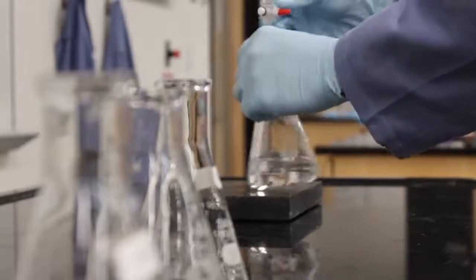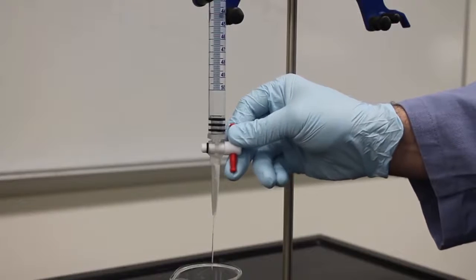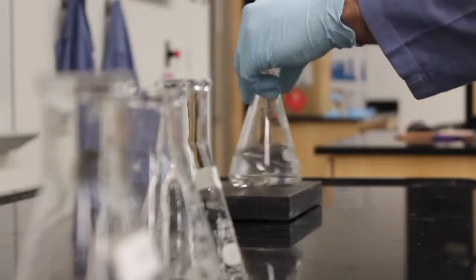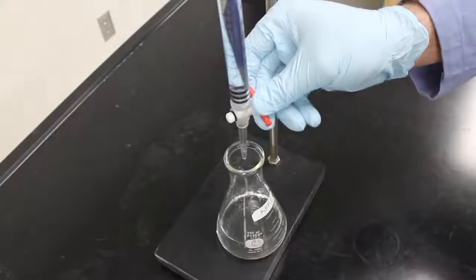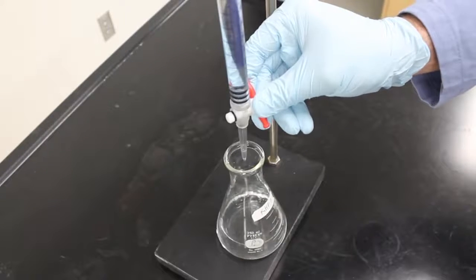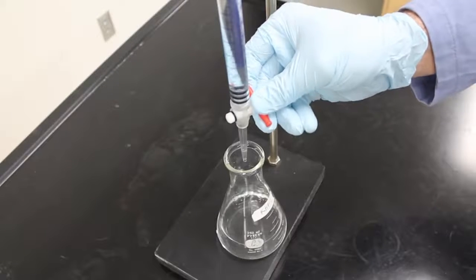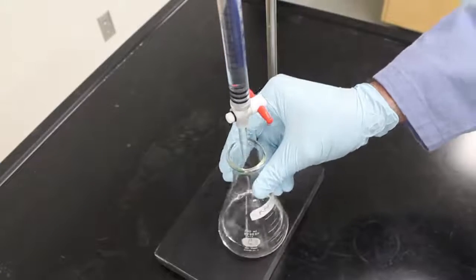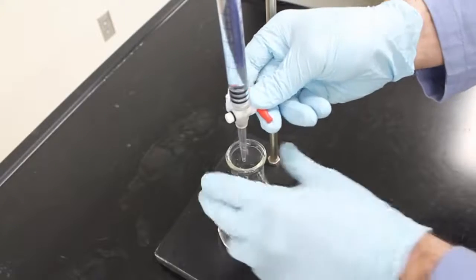Now we can start with our more precise titrations. My scout titration allows me to run the burette down to 13 milliliters before I need to start adding more slowly and eventually dropwise until I see a color change. You need to slow down 2 to 2.5 milliliters before the point that your scout titration indicated. This is because during the scout titration it is very easy to over-titrate without knowing.